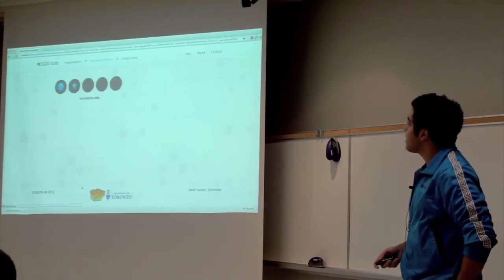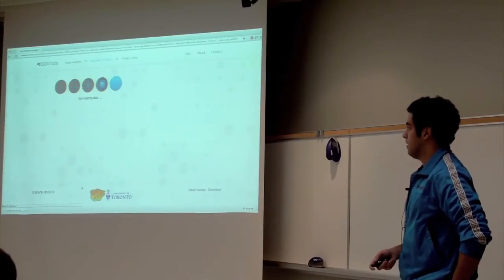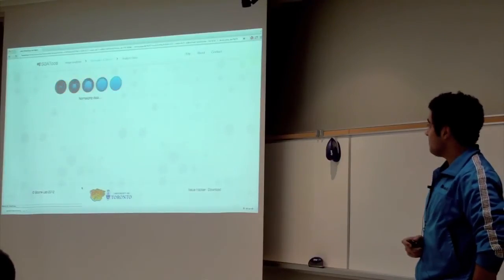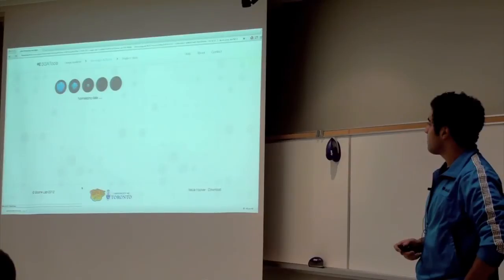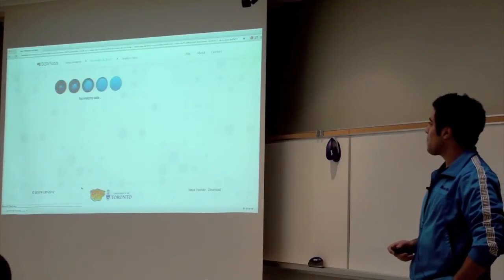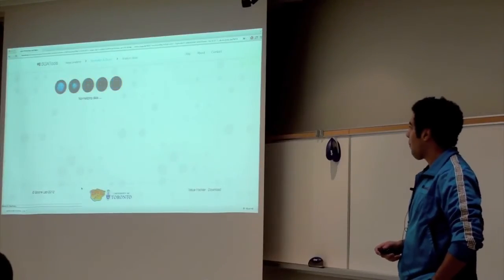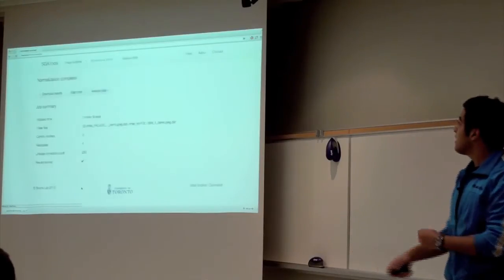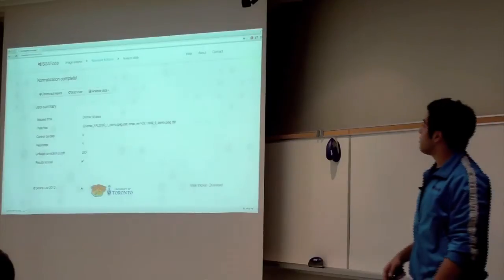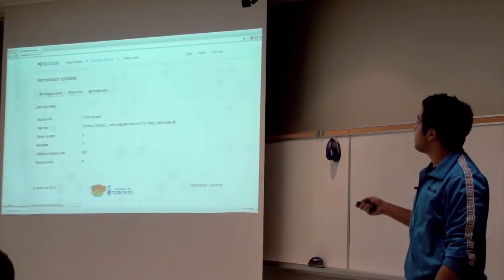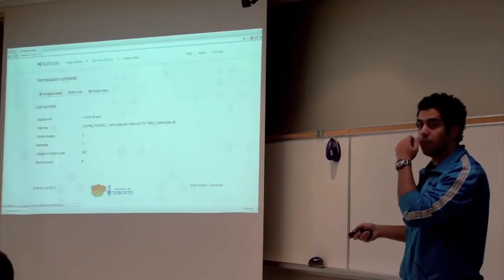So once you choose to score your results, there are different functions that you can use to score your results. Typically, I'm just going to choose the first one, which is the default. And we're going to go ahead and normalize and score. Again, it takes about five, six seconds. Once your data has been normalized, you're directed to a page like this, where you can have a look at your data, download your data, which is what we'll do.